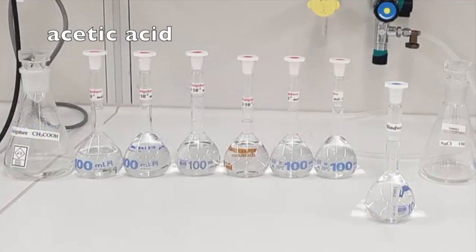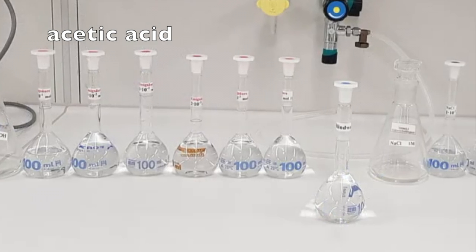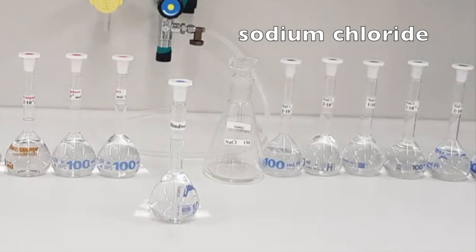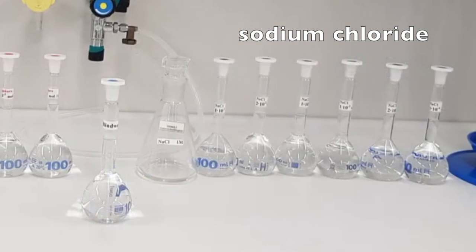In this experiment, the conductivities of the weak electrolyte acetic acid and the strong electrolyte sodium chloride are measured at six different concentrations each.